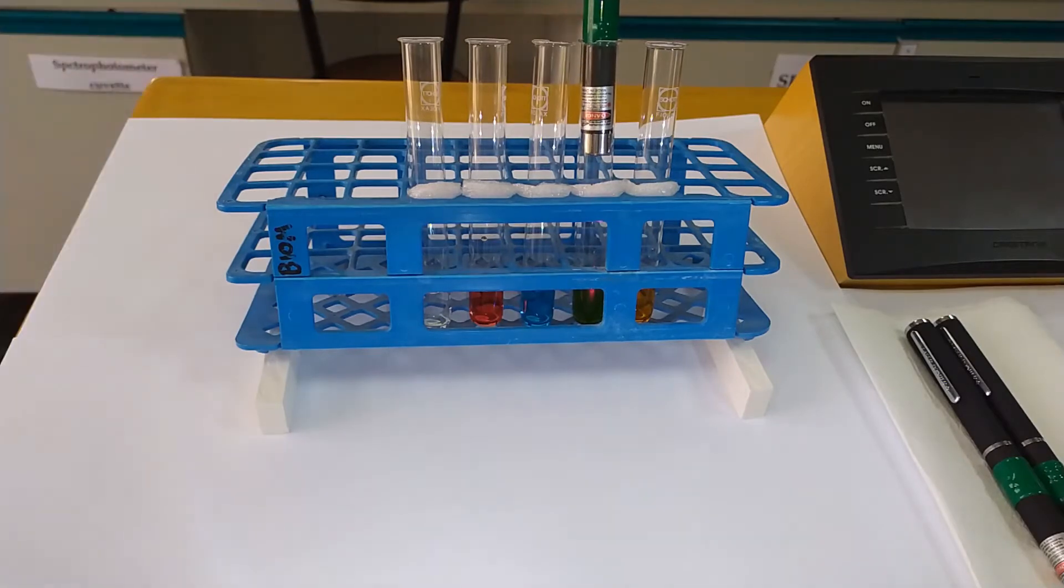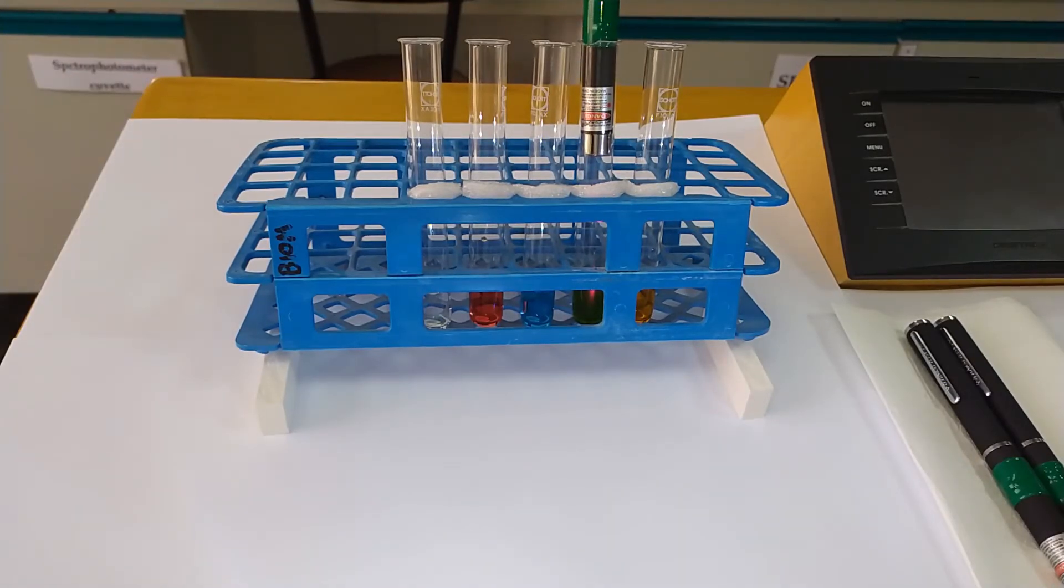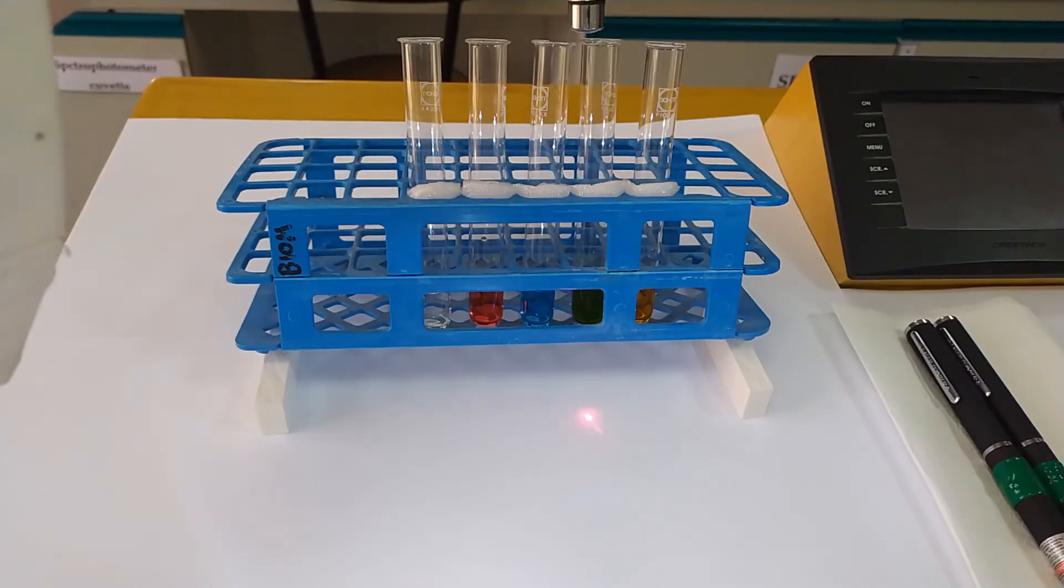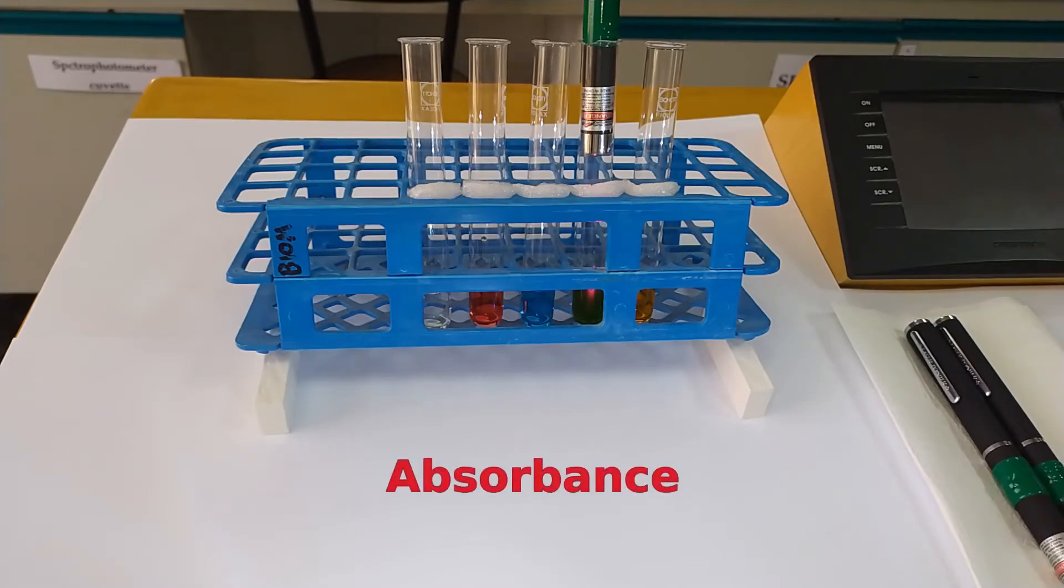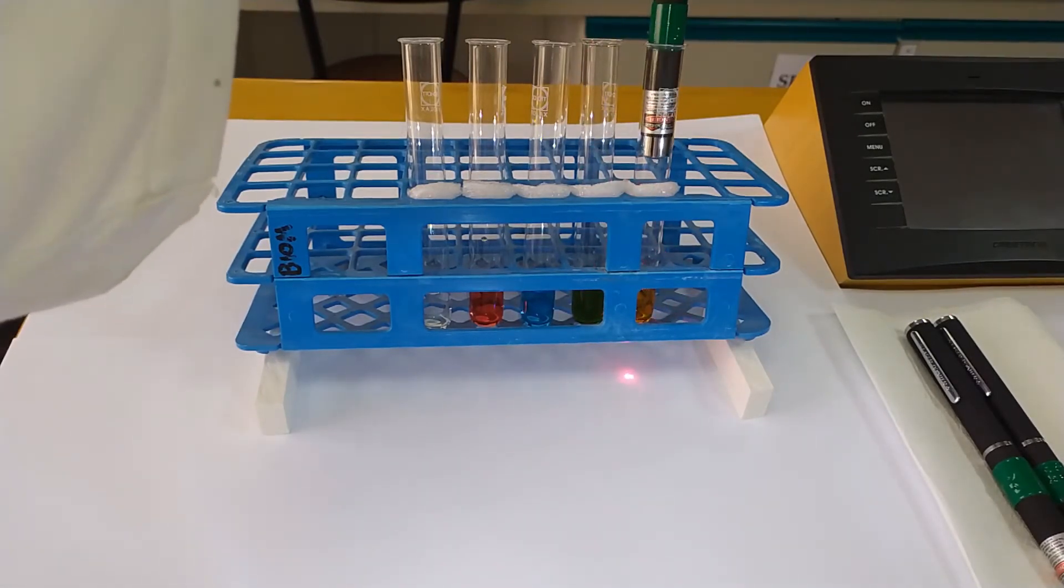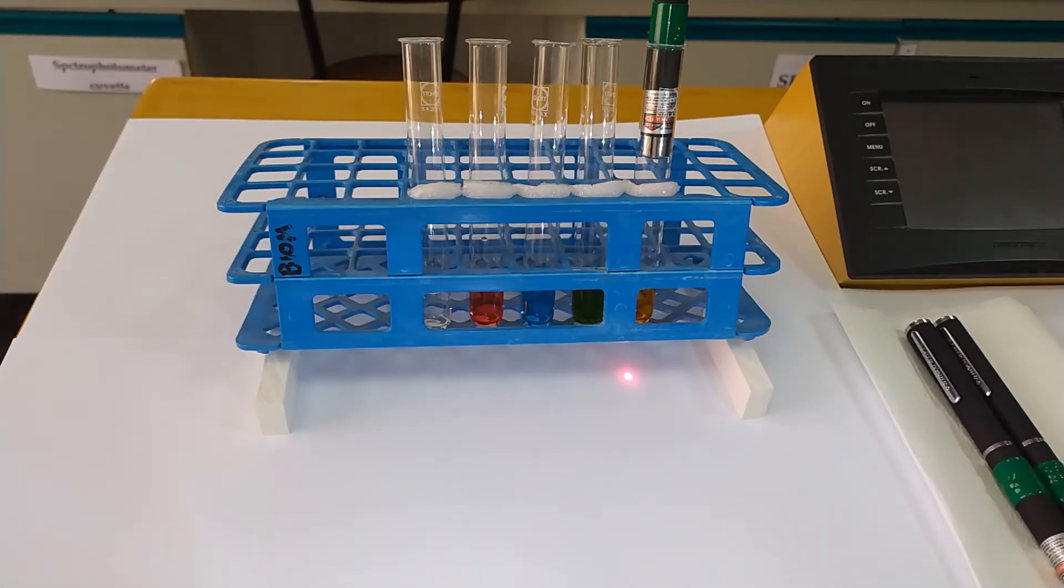Now let's try this with the chlorophyll tube. Hmm, nothing passes through. Again, just to confirm, the light is on, but it is being blocked by the sample. We call this absorbance. Let's continue on to the yellow-orange tube. And here again, the light passes through.